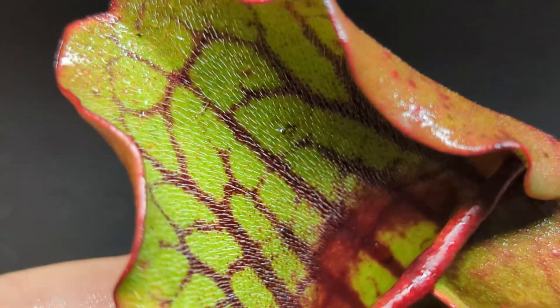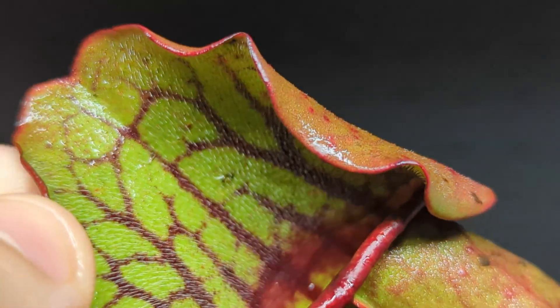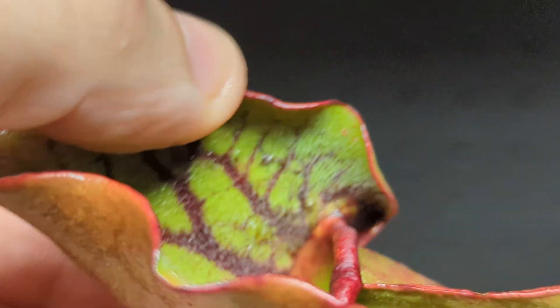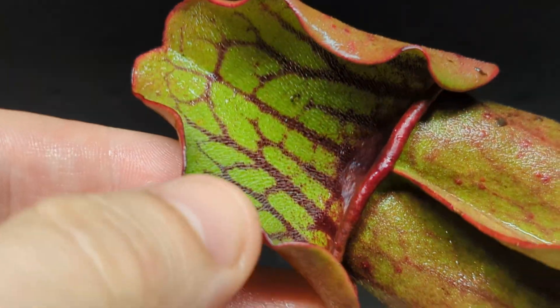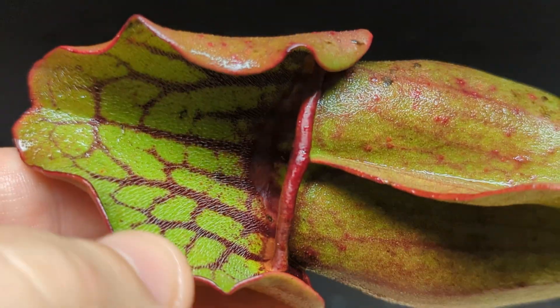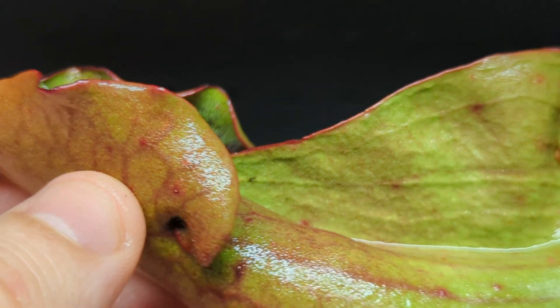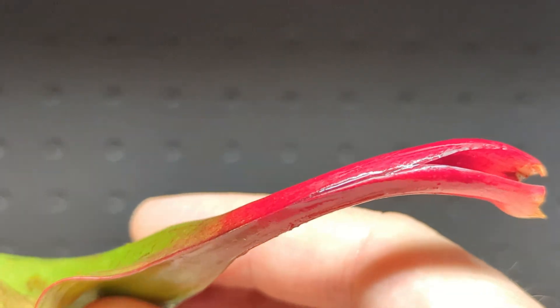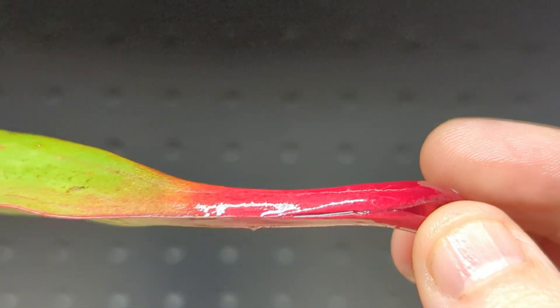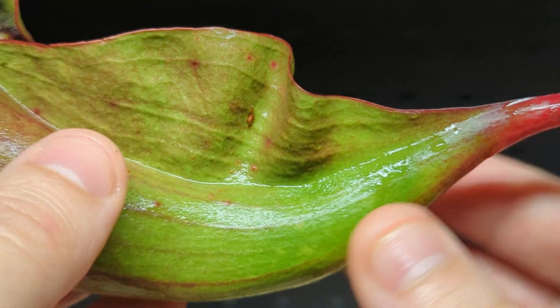Today we are going to dissect this creature — Canada's carnivorous plant, Sarracenia purpurea. If the diagrams I've seen are correct, what we're going to find in here is very mysterious: there are a bunch of trichomes at the base of this plant and nobody knows why. It's been proposed that their purpose is to trap organisms, but that doesn't really make sense. You can also tell how this leaf develops — it's actually just a normal leaf that folds in on itself as it's growing and pinches off to form this pitcher.